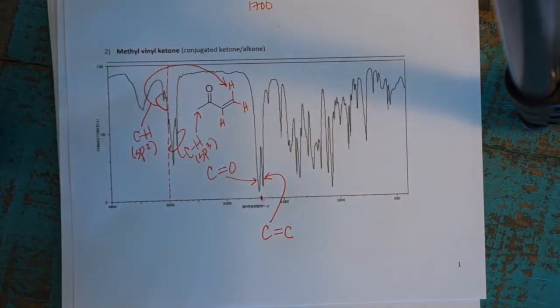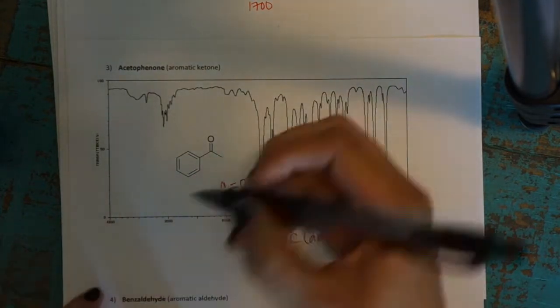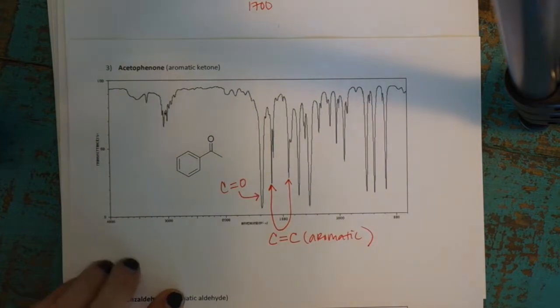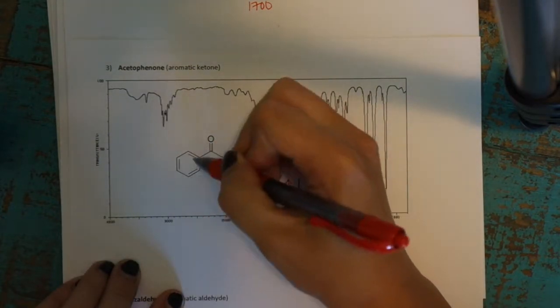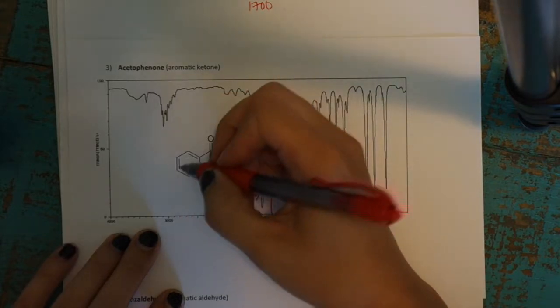That's similar to what we would expect in example number 3, acetophenone, because it also has the methyl group with the CH3s, the sp3 carbons. And then we also have these aromatic sp2 carbons, which are going to have H's on them as well.